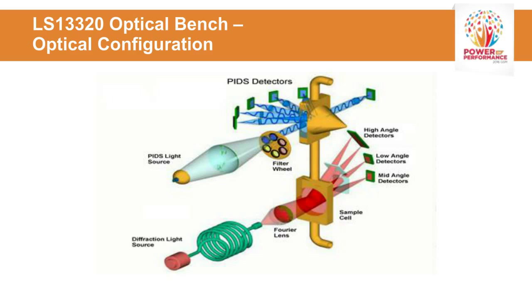And utilizing this fiber optic cable allows a very clean signal, because what you're trying to create is a very clean and very stable signal from the laser. And so this allows, if one is needed, to actually put a new laser in a system in the field without any problem.